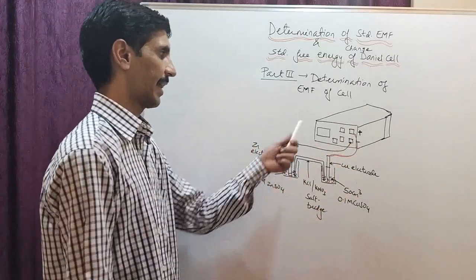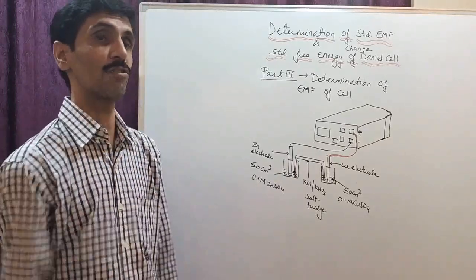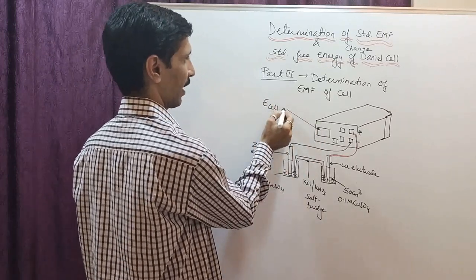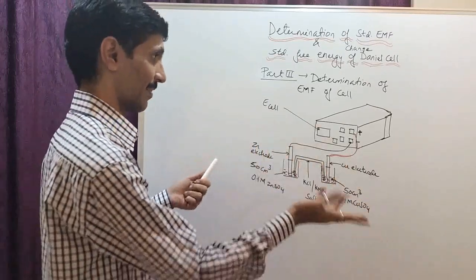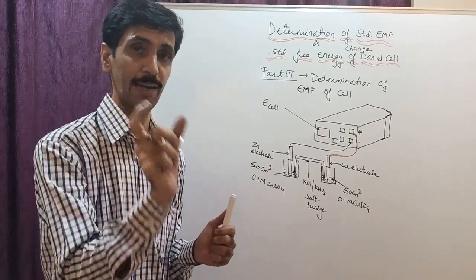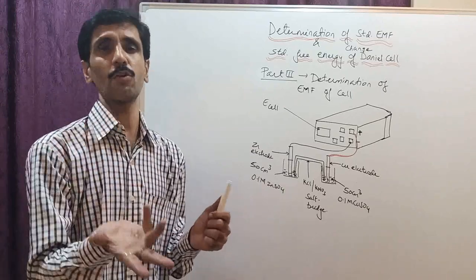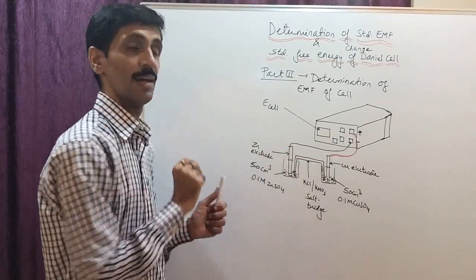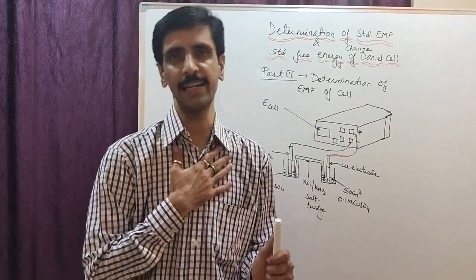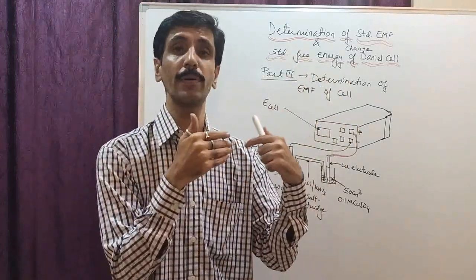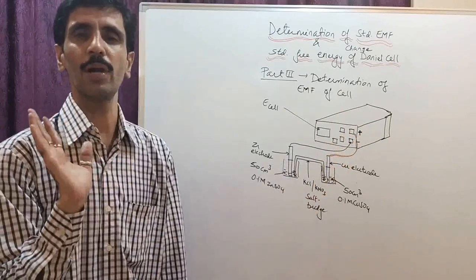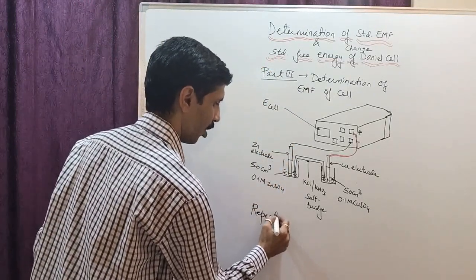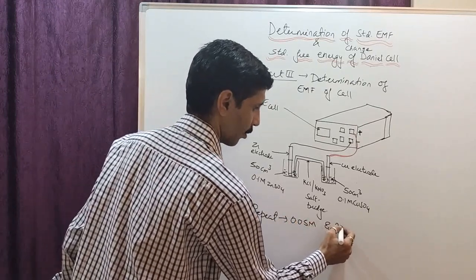Once all connections are made and the salt bridge is in place, you will see a value on the display — this is the EMF of the cell, or E_cell. Note it down. This is for 0.1 molar solutions. Then slowly lift the salt bridge, put it in a beaker of distilled water, wash the two electrodes well with water, throw off the solutions, wash the beakers well, and repeat the same procedure for 0.05 molar solutions on both sides.